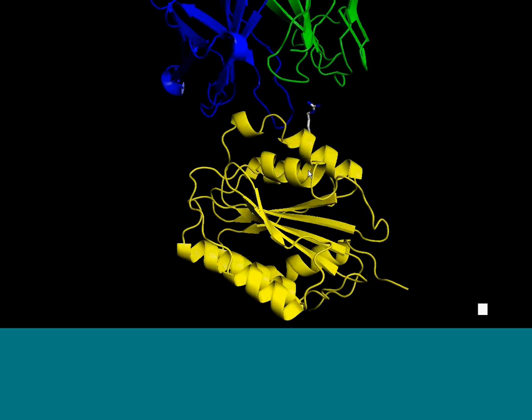We have tried some strategies where we've biotinylated ligands and put them onto streptavidin derivatized chips. And that works very well, but again, you're still running into the limitation of regeneration. So to my knowledge, this is the only technique that's shown to be robust in terms of capturing the antibody and quantitatively capturing the ligand and retaining it throughout the course of the experiment over a wide temperature range. We don't see it coming off when we go up to 35 degrees. It stays on. And then it's quantitatively released when we put EDTA on. I hope that answers your question. But no, I don't have direct experience, but my postdoc has done a lot of that sort of work, and there's a limited longevity when you do other immunocapture strategies where you have to do a more standard regeneration.